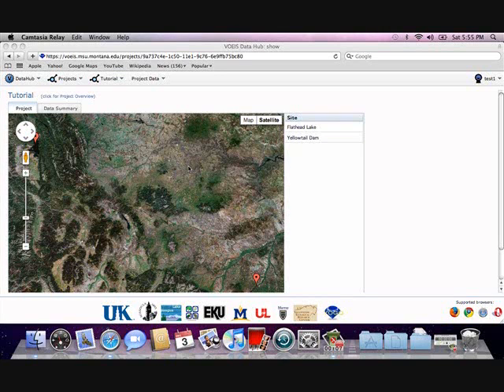This video describes how to successfully load sample data into VOEIS. A sample data value is an individual value or measurement that is associated with sample volume collected from some medium, such as stream water grab samples or soil core samples. Individual samples may be associated with one or more variables.